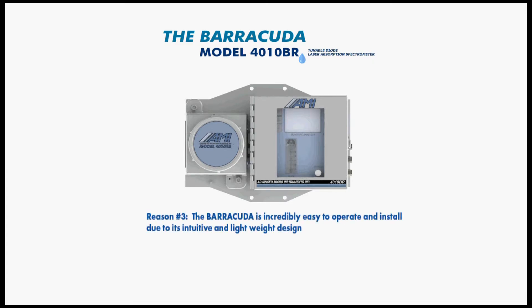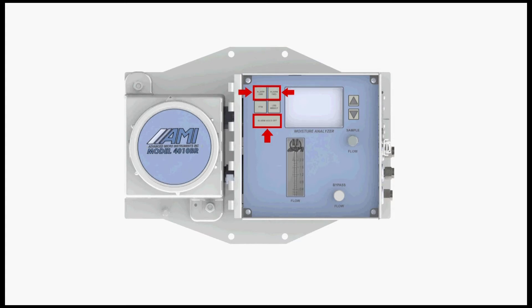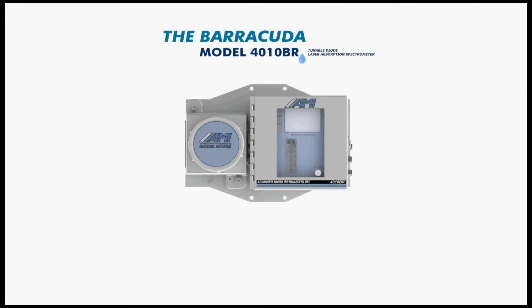Reason number three: the Barracuda is incredibly easy to operate and install due to its intuitive and lightweight design. The front panel interface is based on the standard layout for all AMI gas analyzers and gives users access to the core functions of the Barracuda Model 4010BR. With the touch of buttons, users can adjust the moisture alarms and alarm hold off, toggle back and forth between the two available measurement units — pounds or ppm — for the moisture readings and even make limited option changes. Customers already using one of AMI's other analyzers will find it relatively easy to begin operating the Barracuda for trace moisture measurements.